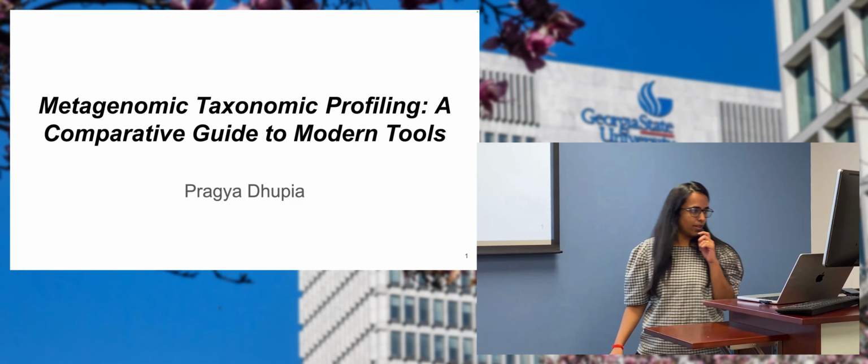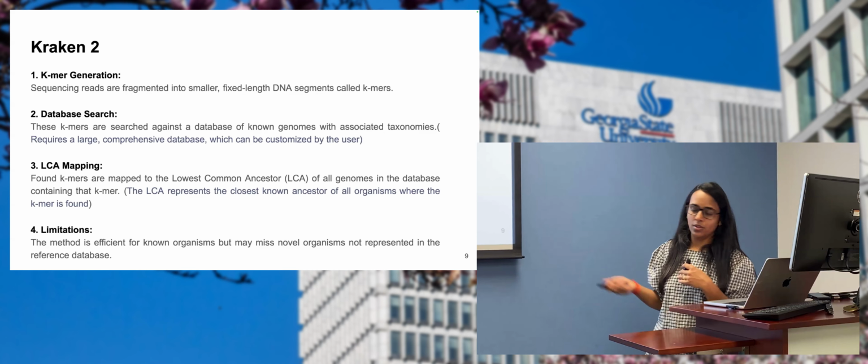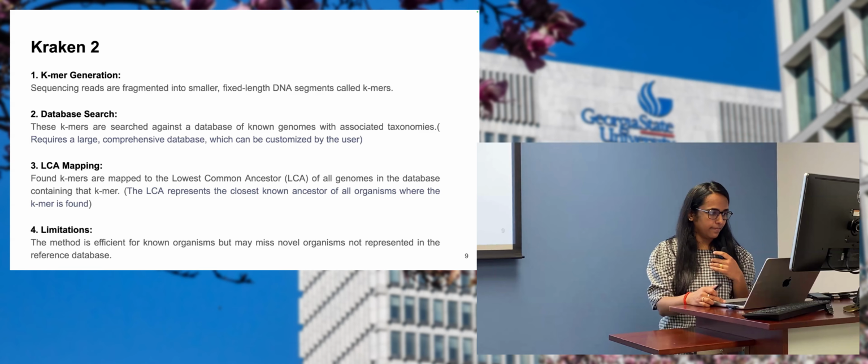And again, the limitation is the reference database. If you don't have a good reference database, you won't be able to get the result.